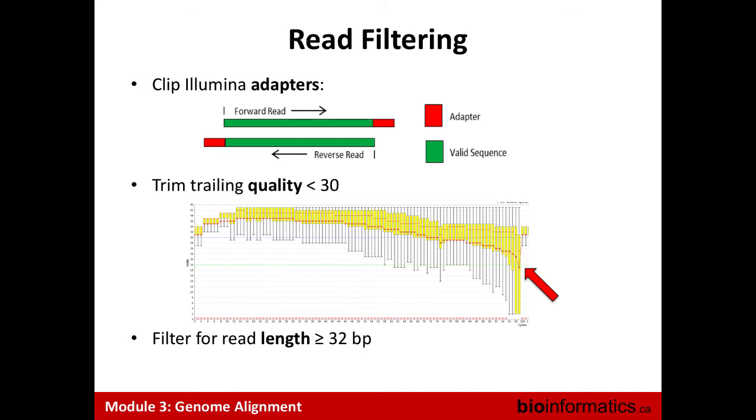When you do your shearing, you target a specific insert size. If your insert size is small, or if the standard deviation of what you get from your shearing has a large variability, you will have most of your fragments around the size you select, but it's a Gaussian normal distribution.